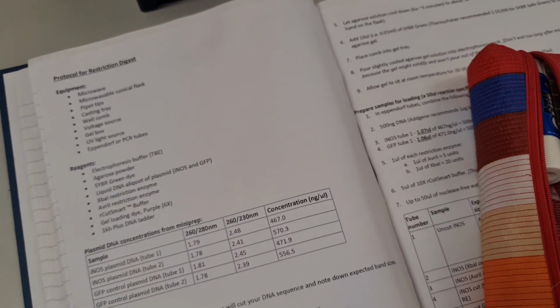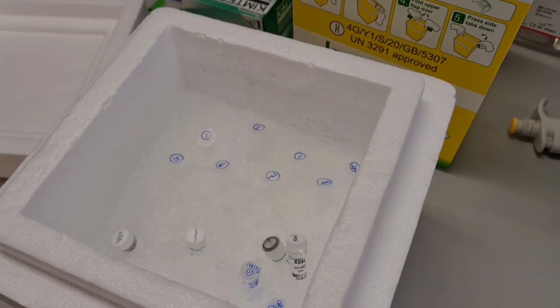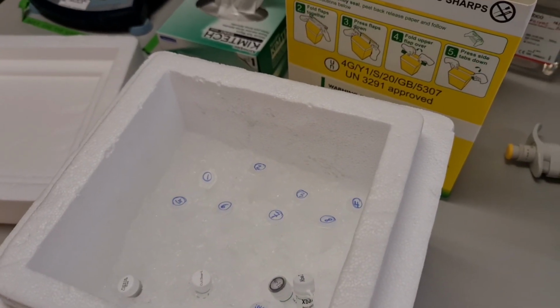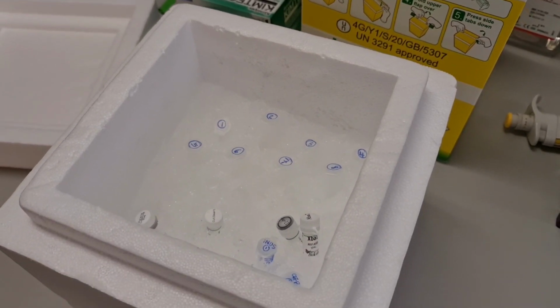And after preparing the agarose gel, I need to prepare some of my samples on ice. So now I need to heat it up at 37 degrees Celsius on a heat block for a couple of minutes, and then it's ready to load into the gel.